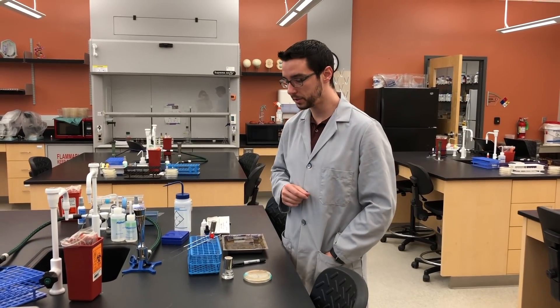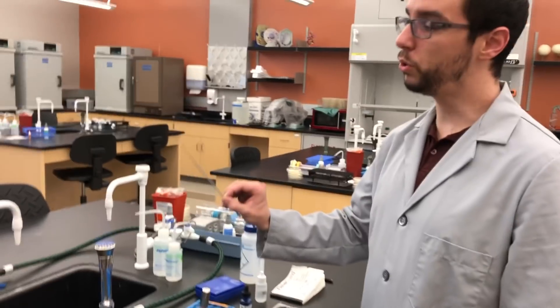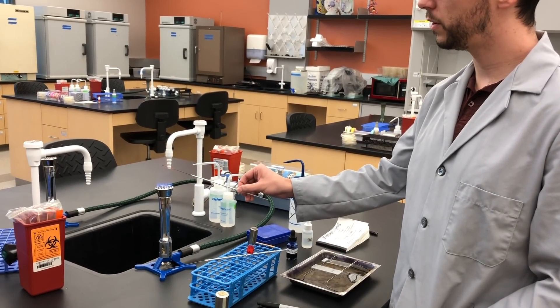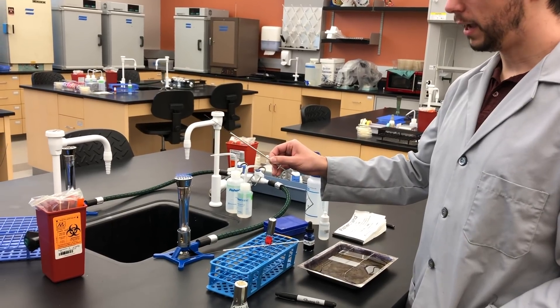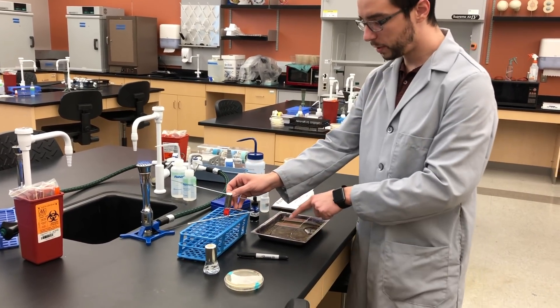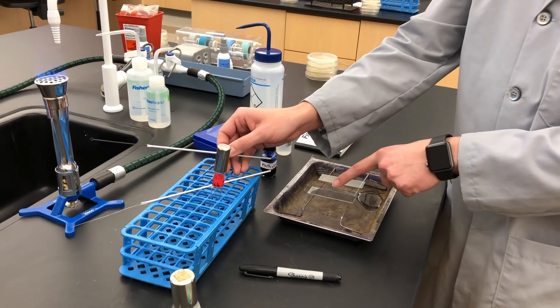First thing first, we need to get our slide ready. We're going to take our inoculating loop and make sure it's sterile first just to be safe.